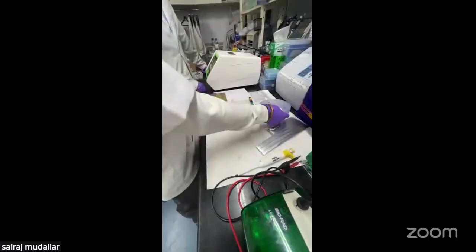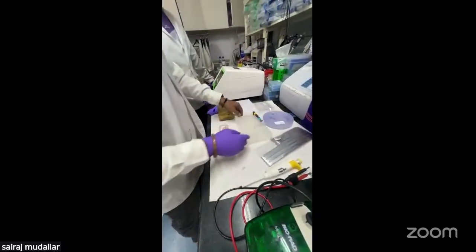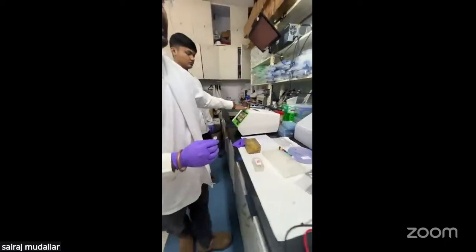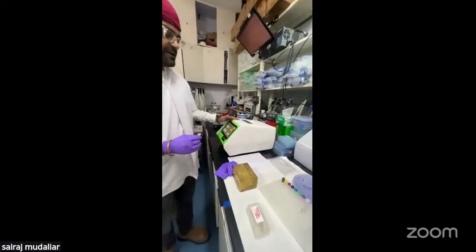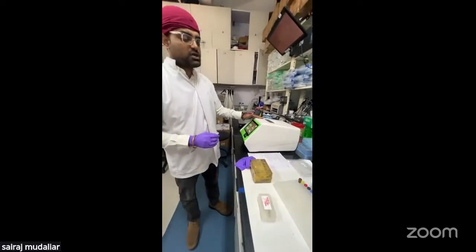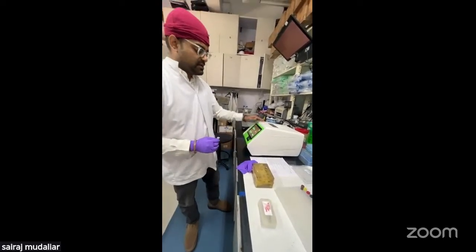So this is how, once the tissue sample is measured, we generally lyse the tissue sample to get the cell lysate. This is a tissue bead box, a proteomics tissue bead box, which uses magnetic beads for the lysis.